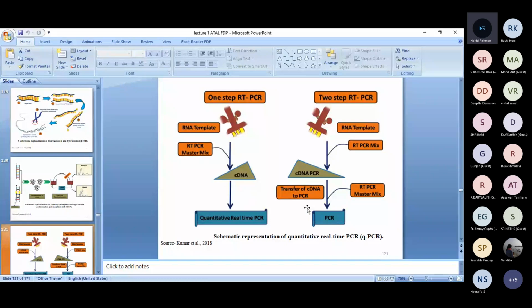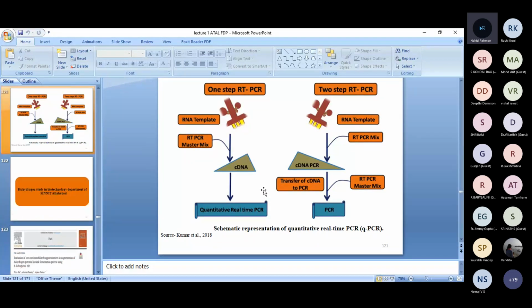So you have to realize how this technology is associated with the isolation of the RNA and synthesizing the complementary DNA, which gives you the overall expression profile of the status of your microbe, your ecosystem or your health. It's up to you where and how to exploit these technologies.